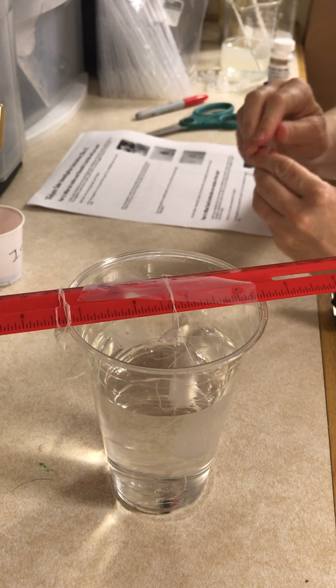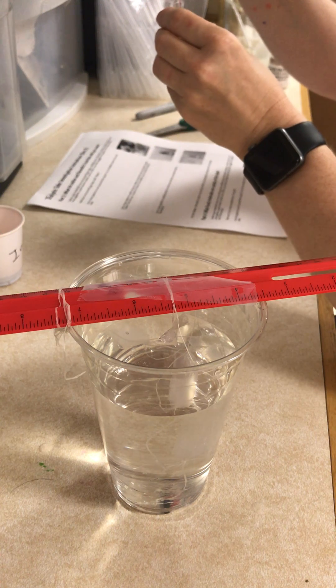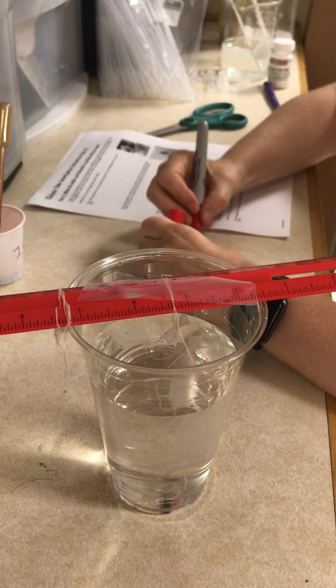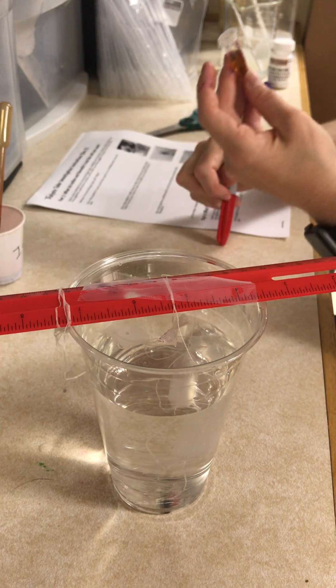In the first tube I'm going to add five drops of iodine — one, two, three, four, five. I'm going to cap it and to the label on that tube I'm going to add plus iodine, and put that tube off to the side.